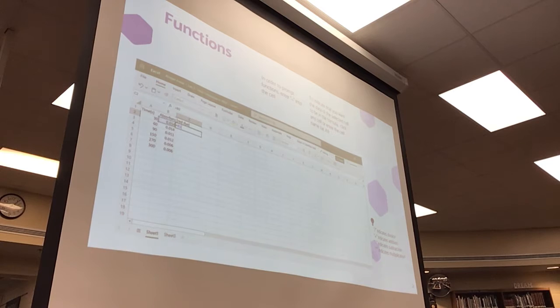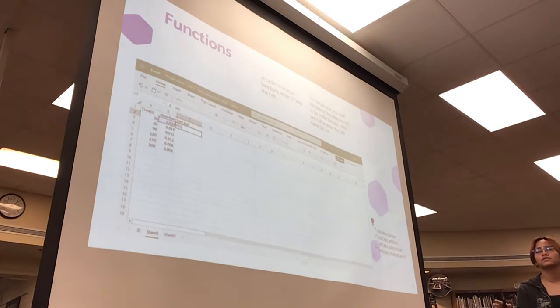So whenever you want to use the data of another cell that you already have, you always click on it, or you just enter the cell name based on the intersection of the column name and the row number. You can see here that it'll enter 0.014 because I entered B2 into the cell after hitting equals. And then always remember your basic function technology language for math. Basically / is division, plus is obviously addition, and so forth.